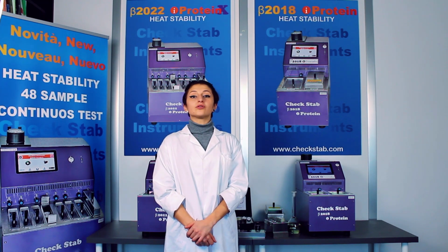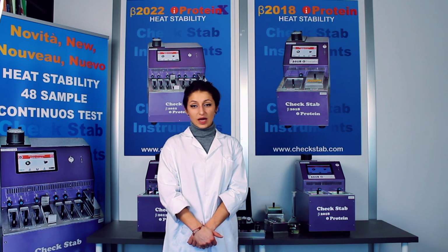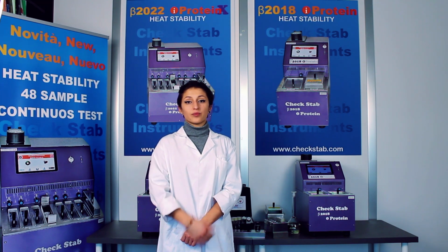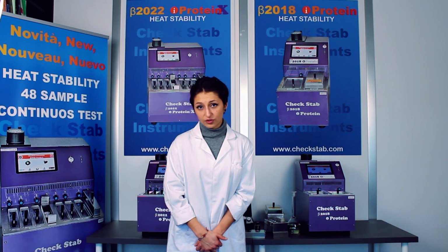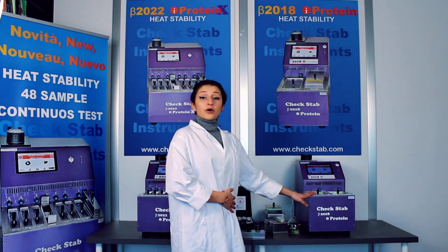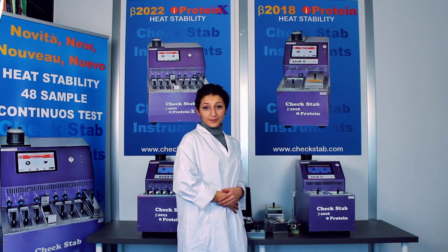CheckStab iProtein is also equipped with 3 customized protocols where you can choose the time, temperature and stability limits, and other 4 CheckStab protocols with the preset parameters for those who approach protein stability tests for the first time. iProtein is standalone and it's all managed by the touch display.